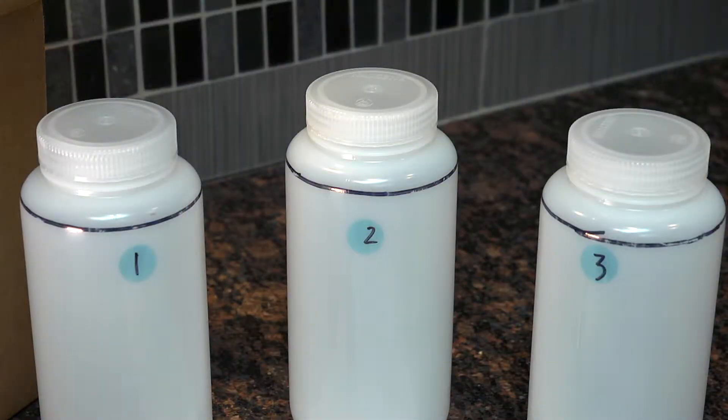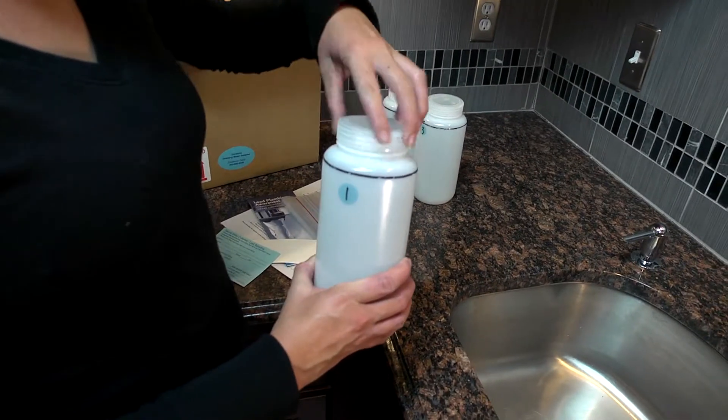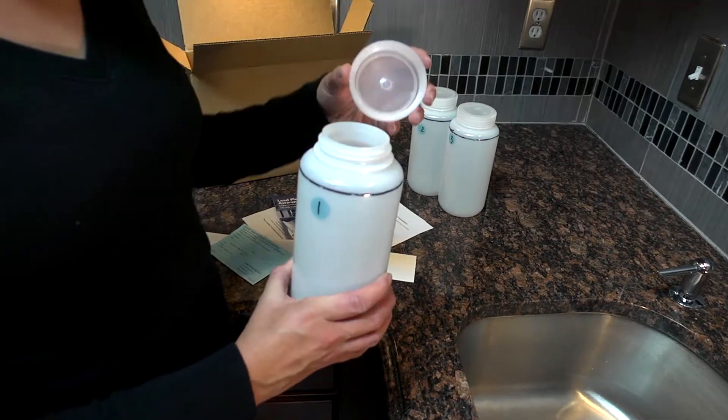Set the bottles next to the sink in order one, two, and three. Remove the lids and have a timer on your phone or watch handy.